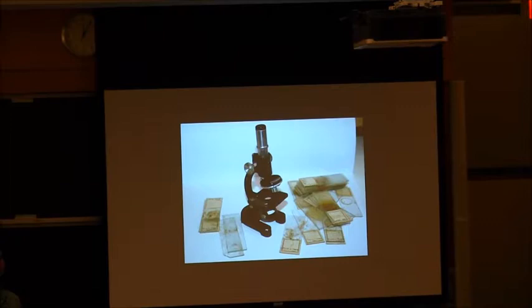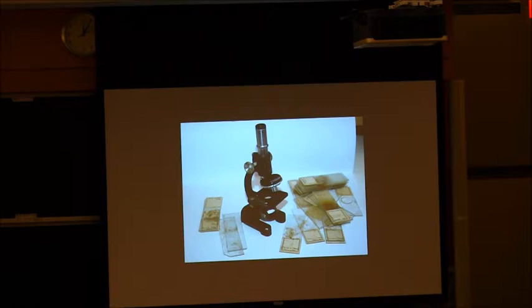So microscopes originally discovered things like bacteria and protists and all these things that were too small for our eyes to see, but themselves were very tiny and very thin, and you could easily transmit light through those to illuminate them and get it back to the eyepiece, to the camera or your eye. And so microscopes were always developed with this in mind, that they're going to be looking at these really small samples. So the objectives here, there's not a lot of space between the objective and where the sample sits, and you're often relying on light to just pass through the sample and then get to the objective to go up to the eyepiece for that illumination.